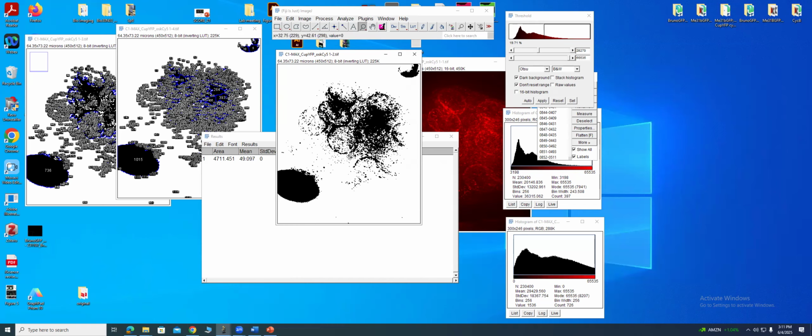Another key here is the watershed algorithm. The software detects slight changes in pixel intensities that are hard for you, or for the software, to distinguish originally. When you apply the watershed algorithm, it notices those subtle changes and creates a dam there.